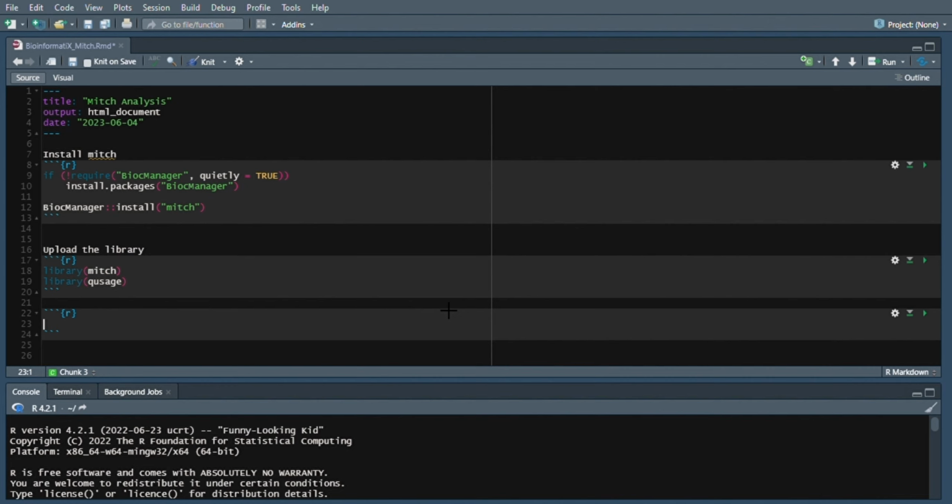Because RNA sequencing data is prone to bias, a normalization step is essential. In our case, the DESeq2 package in R was selected to do the normalization step. Then we ran the results function in order to extract the results tables from a DESeq analysis, giving base means across samples, log2 fold changes, standard errors, test statistics, p-values, and adjusted p-values. The results tables will be the input data to run our Mitch analysis.